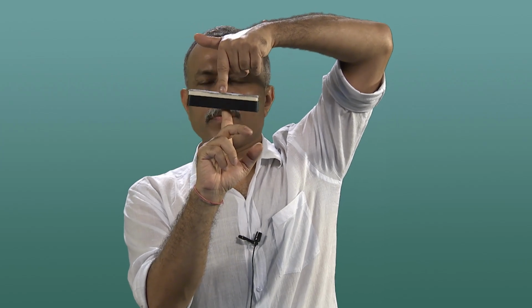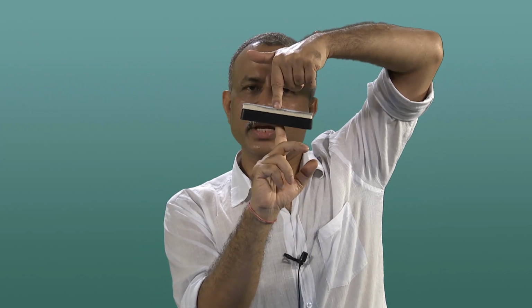Now, you apply a voltage across it, there will be a change in its structure. So, it is reverse both ways. You can generate electricity by compressing it, or you can give it electricity to compress it.